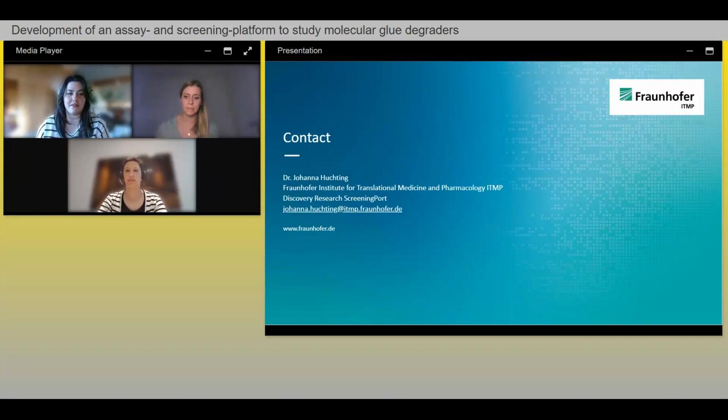Wonderful, thank you. All right, our next question here says, this is for you, Johanna. Which are typical false positives that you find in your HTRF screening? So I would say this depends really on the compound incubation time that you use. When you can work with short compound incubation times, as we did in this RBM39 case with 6 hours, that is still on the short side, you definitely limit your false positive rate by that.